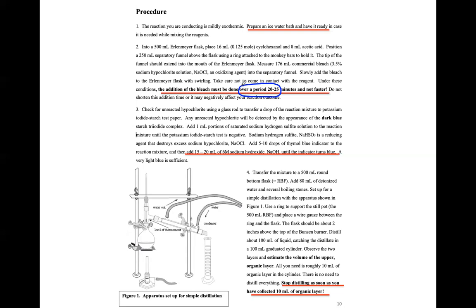Okay. Now, once that time has expired and all the bleach has been added, we want to make sure that there's no bleach left unreacted.